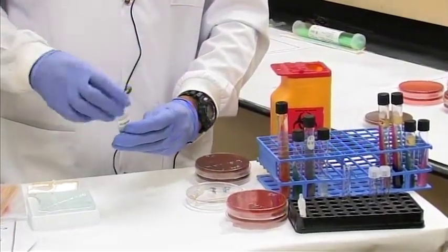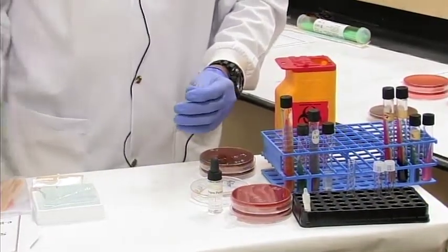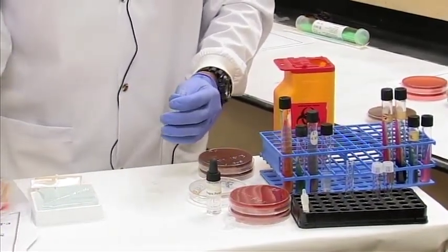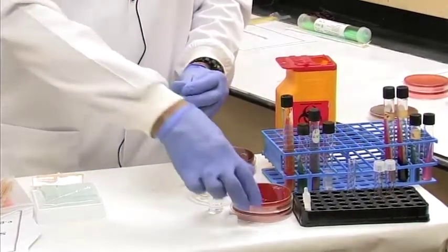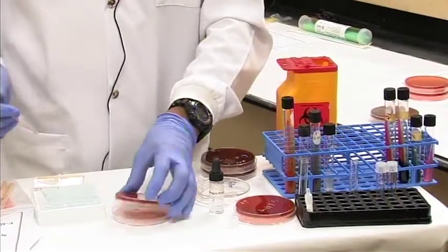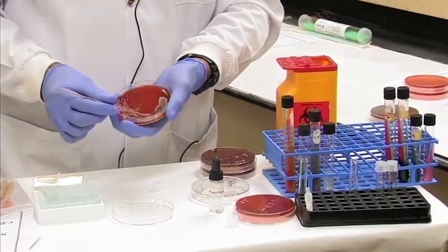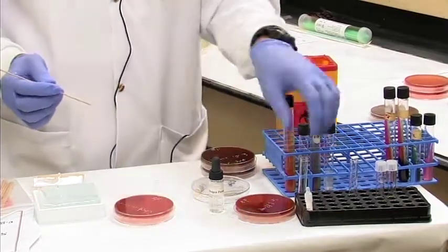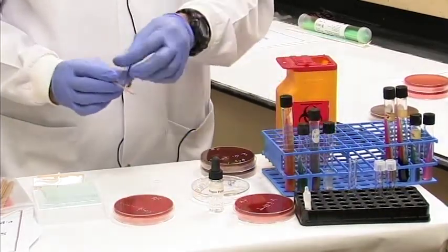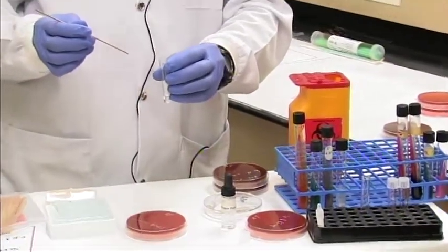This test can also be done on a microscope slide. And we're going to pick up some of our bacteria, our Staphylococcus bacteria here, using a wooden applicator stick. And then we're going to immerse it in a test tube with your hydrogen peroxide.